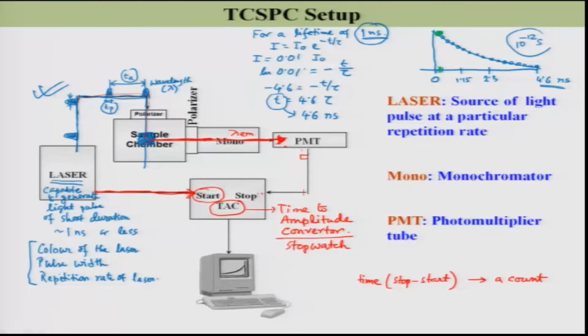It is not guaranteed that this photon will come along this direction. It is possible that this photon will go in that direction, because this type of emission is spontaneous emission, which is directionless. So, it can go in any direction, to the upper side, lower side, left, right. So, only when the photon at this particular time is along this line will it be detected.